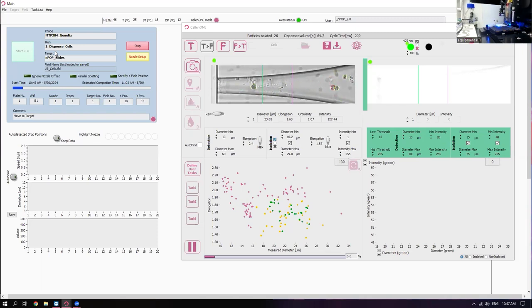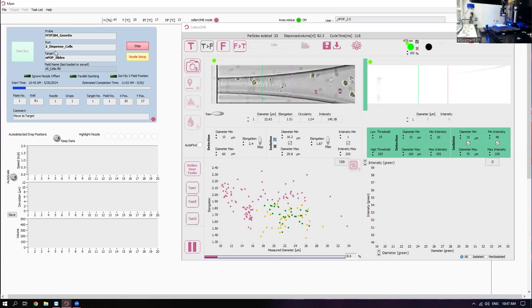It's just got a list of positions that it needs to fulfill with a single cell. That list of positions could be all of the positions, like it is here. If multiple cell types have been selected, then it's going to fulfill that partial list of positions for cell type one. It'll finish the run. You'll then take the next cell sample, optimize it for which cell you want to take, then you'll print that second cell field file, which will be that separate list of positions, so that you can end up having a different cell sample in the same sets.